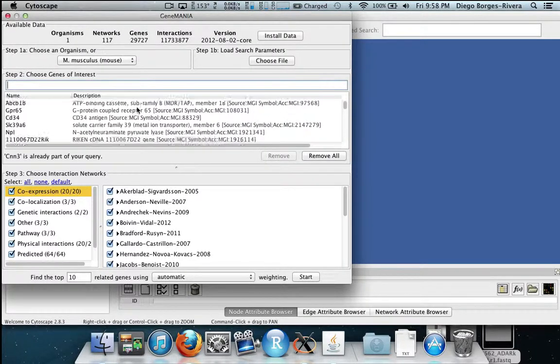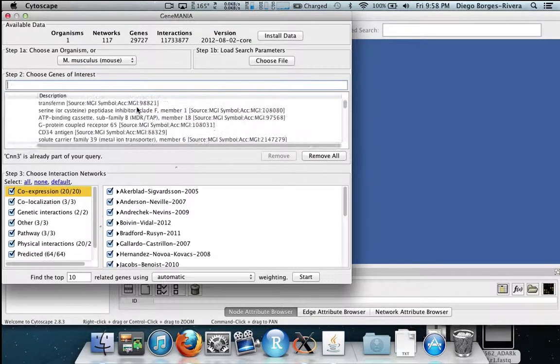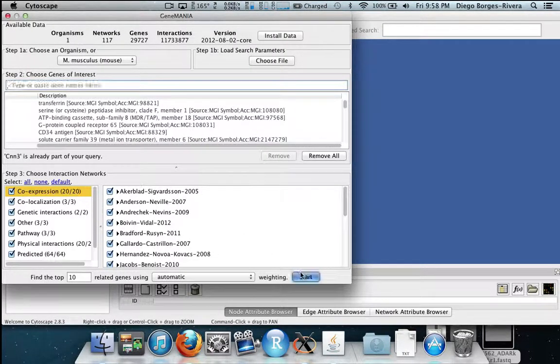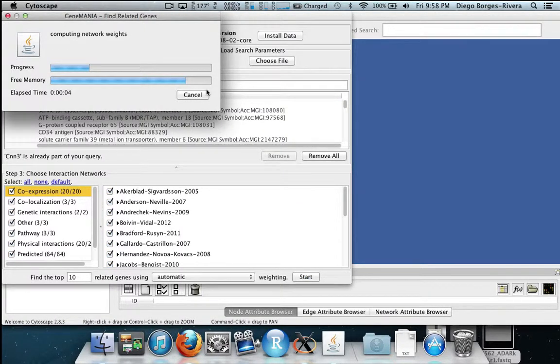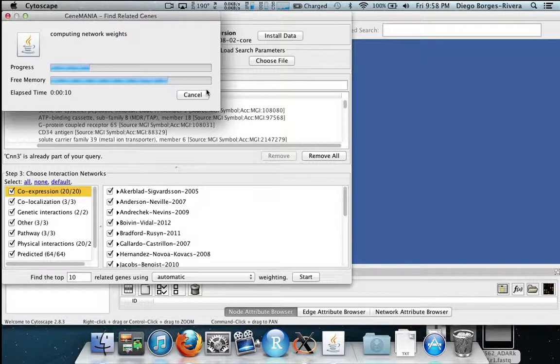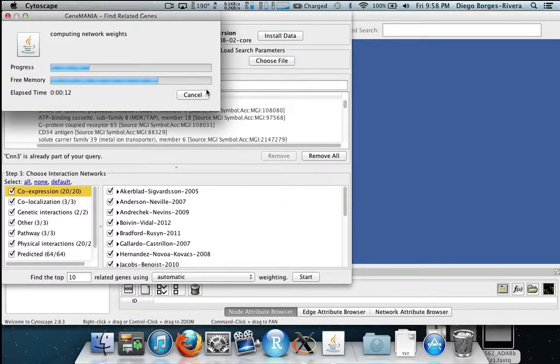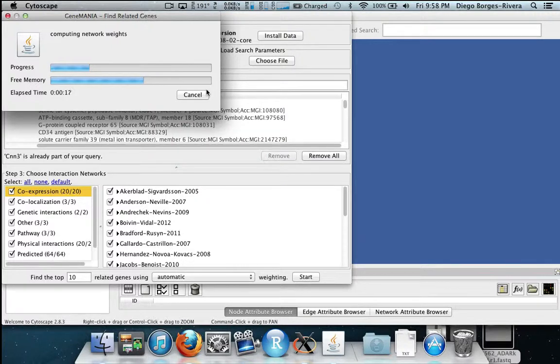We now hit start and this will generate an interaction network of the genes using the genes of interest we have provided. As you can see here there will be a bit of processing time which will take a significant amount of computing resources. Just as a side note you will want to close this window after you are done with it or it will continue to use these resources.